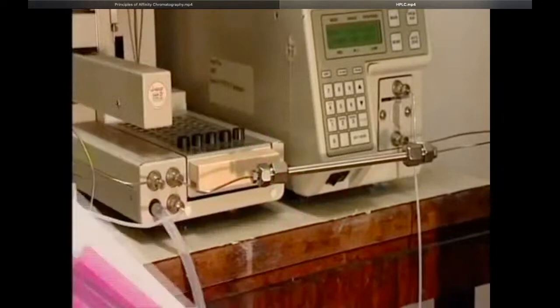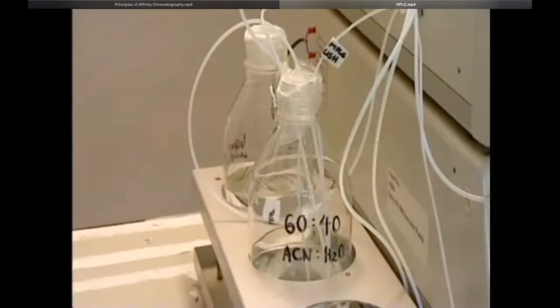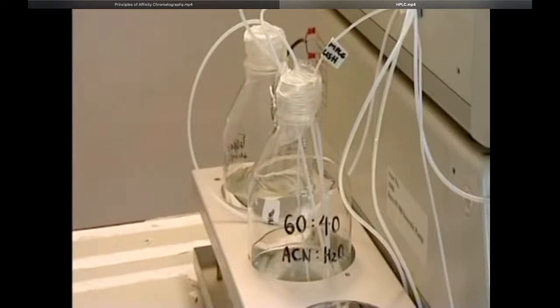In paper chromatography, the solvent moves along the paper by capillary action. In HPLC, the liquid is forced through the column by high pressure pumps. The whole apparatus looks like this. These bottles contain solvents. Two solvents can be mixed in any proportions to give a mixture, the liquid phase, of suitable polarity for the separation that is being done. In this case, one solvent is water, very polar, and the other, ethane nitrile, less polar.